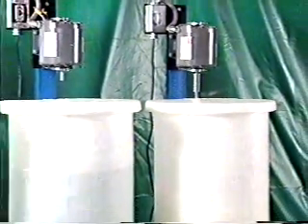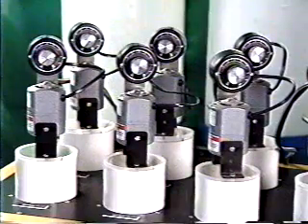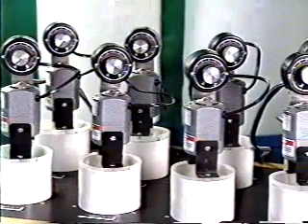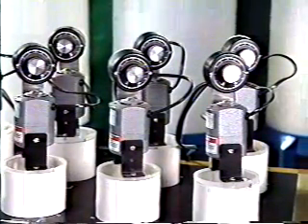The sheet former can make sheets from as many as six different stocks. Up to eight different chemicals can be added to each sheet. Chemicals can be added incrementally in successive sheets.